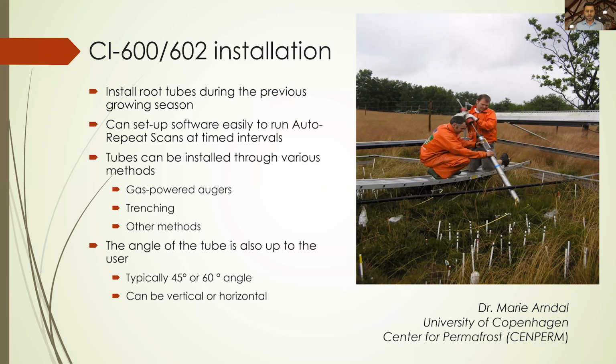Now, the other thing I would definitely mention off the bat, just having run into this myself, is you want to make sure that the soil is not completely compact around the tube. You actually want to keep it about the same density as you would typically find around that plant. That way the roots grow as they typically would and do not either bunch up because there's a lot of space and give them a lot of room to grow, or completely avoid the tube because you've compacted the soil around it and made it difficult for them to grow around the tube.